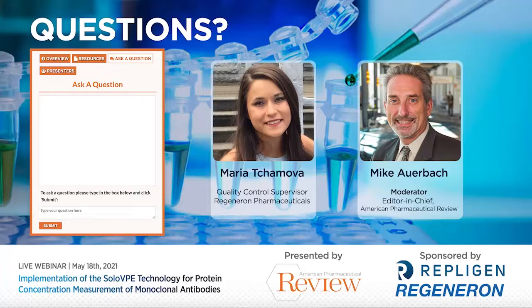Excellent. Thanks again. Our next question is, is there a plan to implement SoloVPE for all monoclonal antibody products, or is it already implemented? Yes, our plan is to implement it for all monoclonal antibodies at Regeneron. Excellent. Thanks again. Let's take a look at our next question.